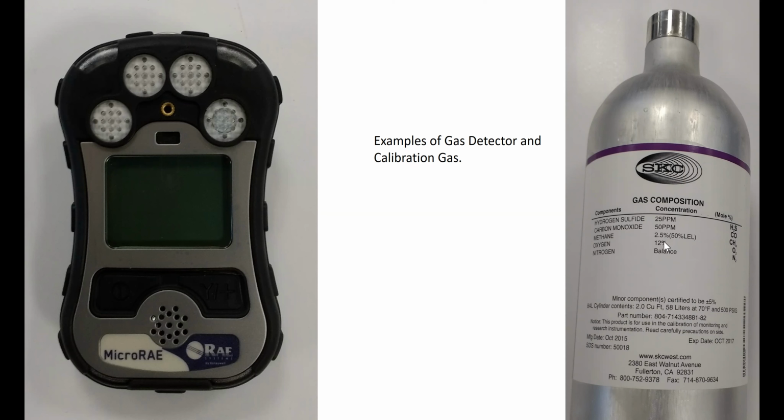Notice our oxygen: when we zero it, we don't really zero the oxygen. We let it go to natural background, which is usually 20.8%. We're concerned about oxygen dropping, so that percent drops. So the range we're calibrating is the 20.8 natural background on down to that 12%, so that it covers the 19.5% that I might be concerned about in an oxygen deficient atmosphere.